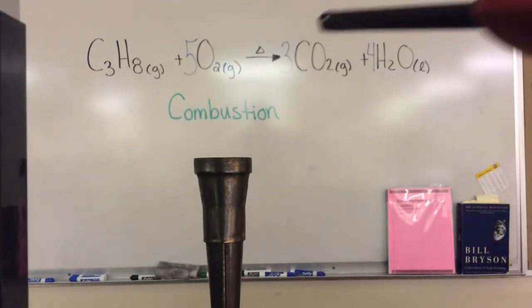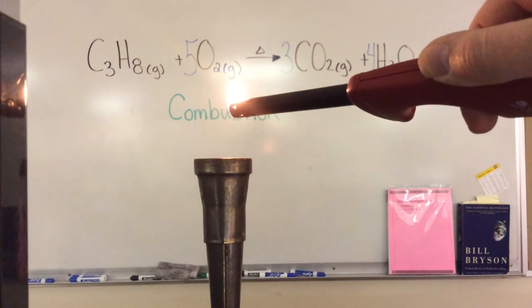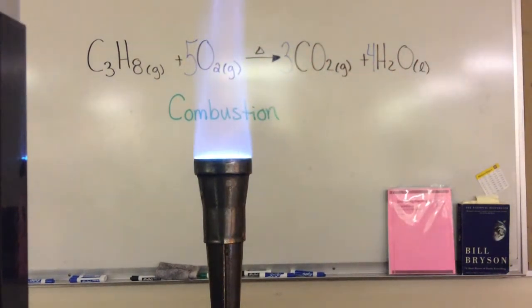The third demo that you're going to witness is a combustion reaction. It's one that you have seen in class many times. It's the combustion of propane. The balanced equation is written on the board behind the demo.